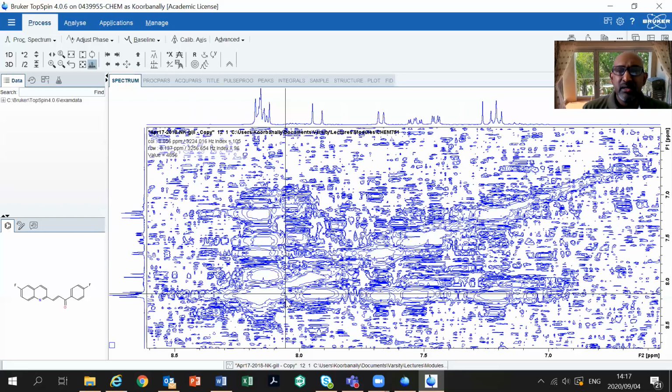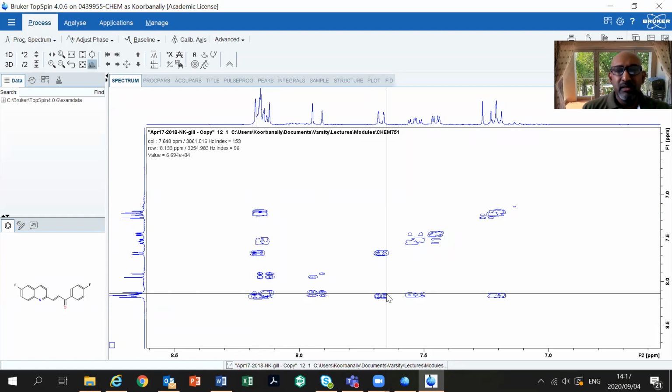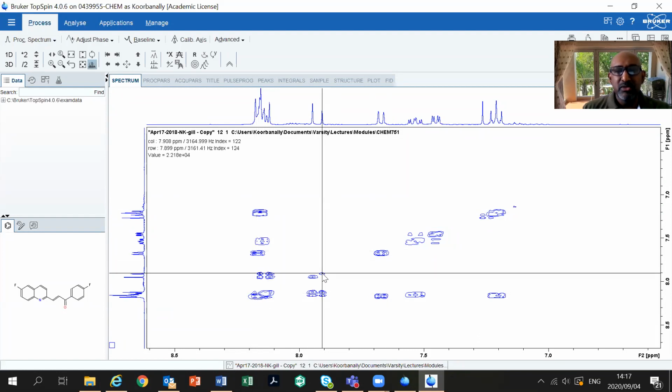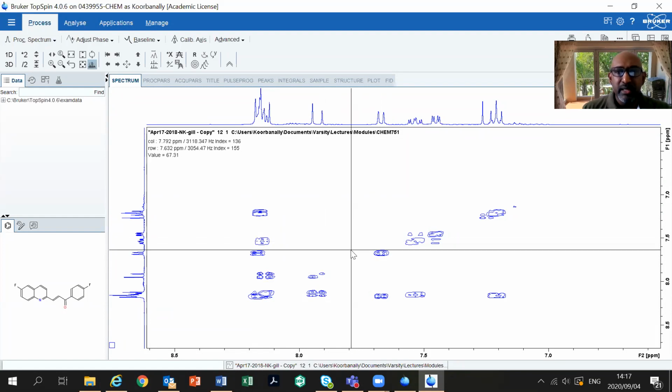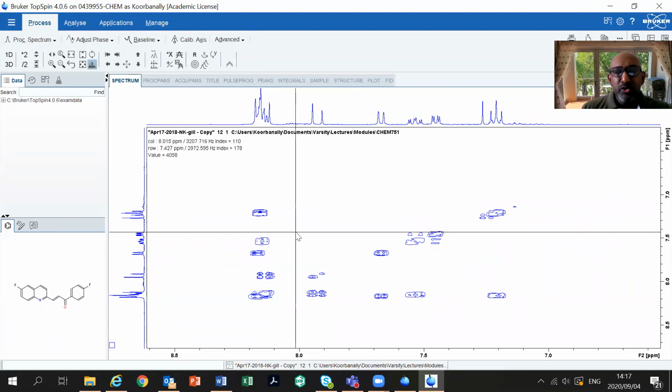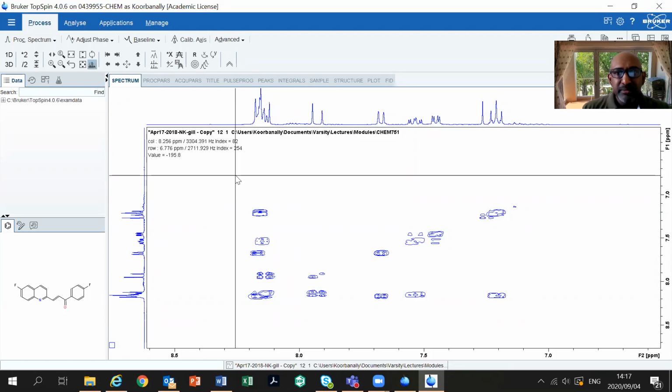And I can do the same thing here. I can increase the noise, or I can decrease the noise drastically, right? And as I decrease the noise, the more pronounced peaks will remain, and the less pronounced peaks will disappear into the noise, right? So you can actually say, as you go higher and higher in the helicopter, what is more pronounced? You can still see the peaks of the mountains and maybe some tall high rises, but you can't see the houses anymore, right? They'll be lost in the noise the higher you go. So that's how you expand a 2D NMR spectrum, by using this crosshair and getting the region that you want.